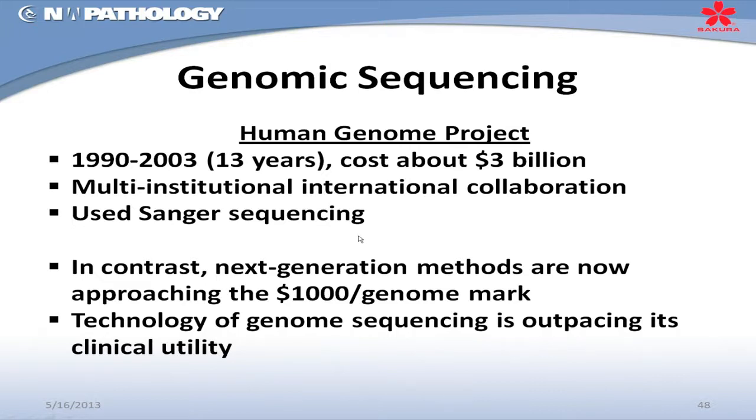which are able to give us much larger stretches of DNA sequencing than we could before. And to sort of explain how effective they are, I'll just mention briefly that the Human Genome Project, which was done about a decade ago, which was the project that showed us what the entire human genome is, that took 13 years and cost $3 billion. That was done by Sanger sequencing.